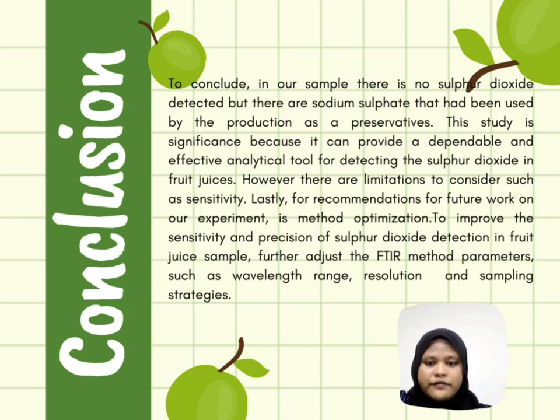This study is significant because it can provide a dependable and effective analytical tool for detecting sulfur dioxide in fruit juice. However, there are limitations to consider, such as sensitivity. Lastly, the recommendation for future work on our experiment is method optimization. To improve the sensitivity and precision of sulfur dioxide detection in fruit juice samples, further adjust the FTIR method parameters such as signal to noise ratio, wavelength range, resolution, and sampling strategies. That's all from us.